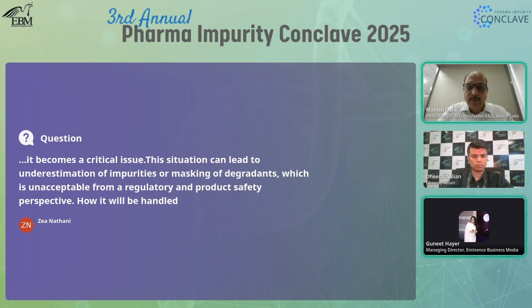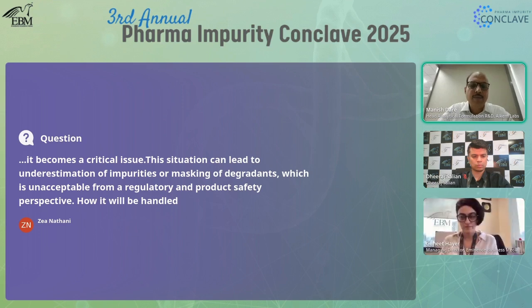If it is one known impurity and another unknown impurity, then the prediction during analysis may be false. A known impurity may become an unknown impurity, or an unknown impurity may become a known impurity. So there is always confusion during assessment and reporting of the result during QC analysis. So it is better to go with the proper separation and report the result accordingly. Thank you.